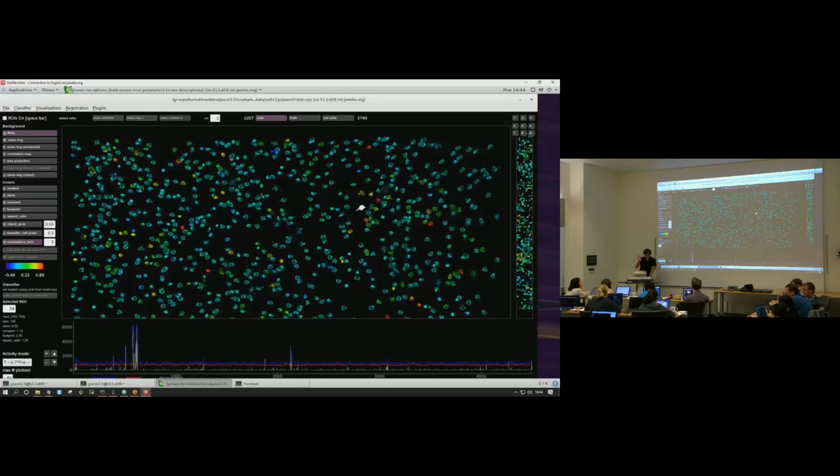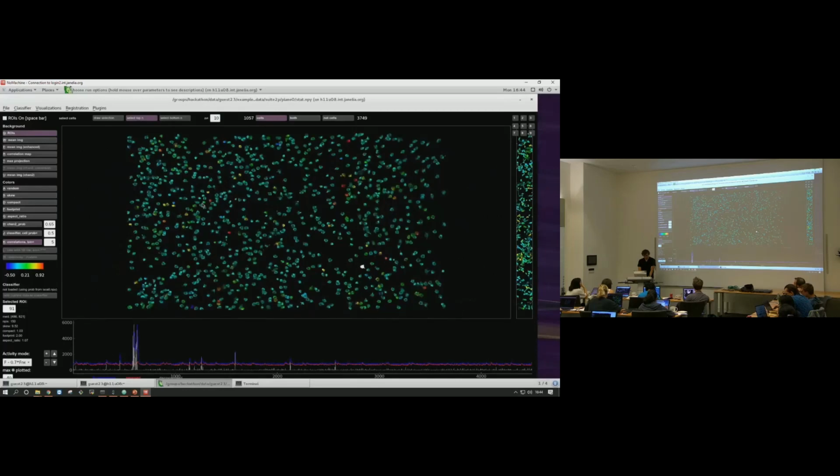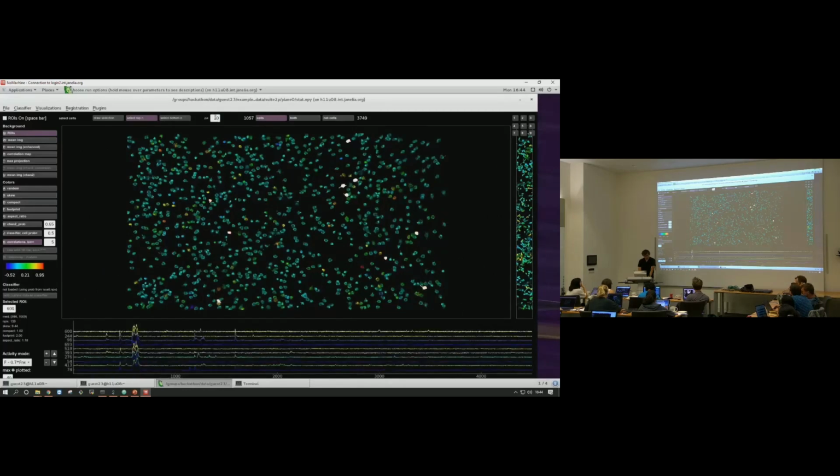Okay, right. So we're in a color map. We could say, let's take the top 10 cells most correlated to this cell. I'm selecting this button up here. Did that work? Press enter. If you change the number, don't press enter. All right, so here's the top 10 most correlated to that cell.